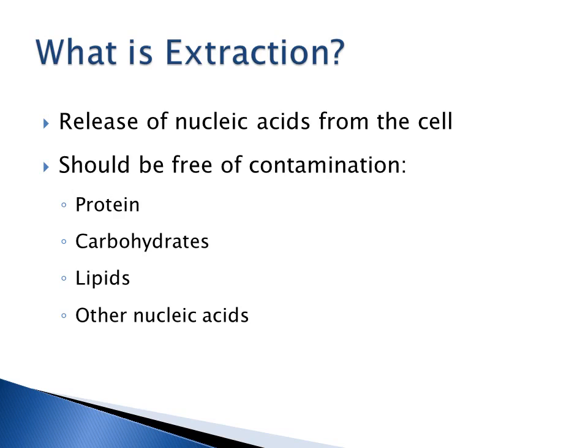You don't want to have any proteins in the mix, carbohydrates, lipids. If you're extracting DNA, you don't really want RNA in there, and if you're extracting RNA, you certainly don't want DNA, so other nucleic acids. So there are various techniques to remove these types of contamination.